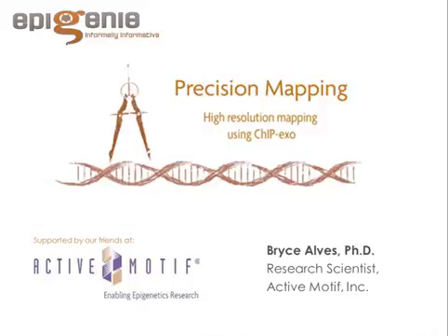So why does your kit use blunt end ligation as opposed to a poly-A tailing technique? We developed this kit to use blunt end ligation simply because the primer set that we finally got to work were actually designed to be blunt end primers or adapters rather than with the A tail. We could definitely convert ours to directional using A tailing, and we just have to add a T to the ends of our adapters.